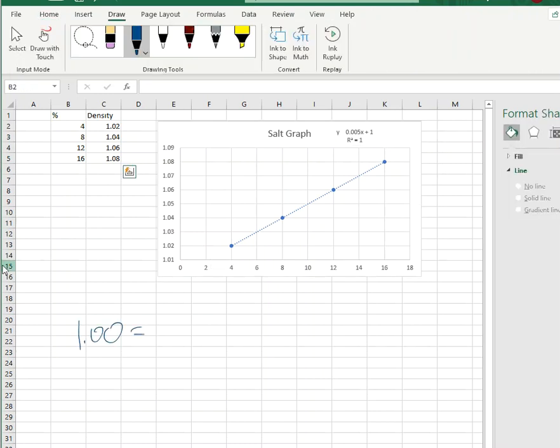Folks, if I get a 1 for the R-squared value, this is a perfect line, which means that your data and your sample prep and your standard preps and the way that you ran them were perfect. I mean, you deserve a cookie if that goes on.